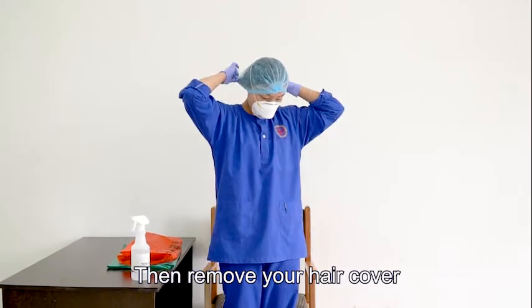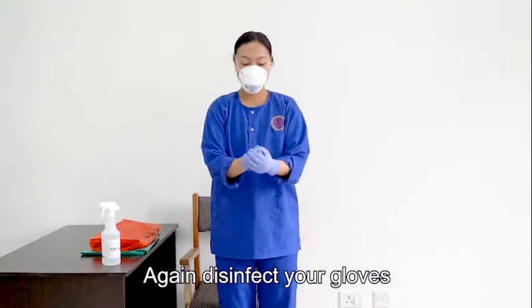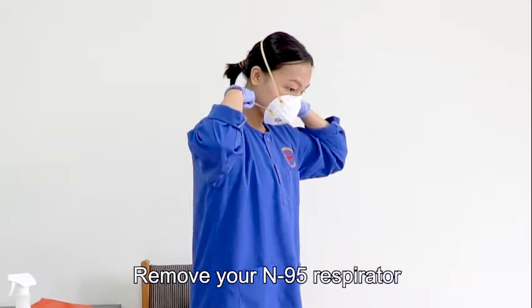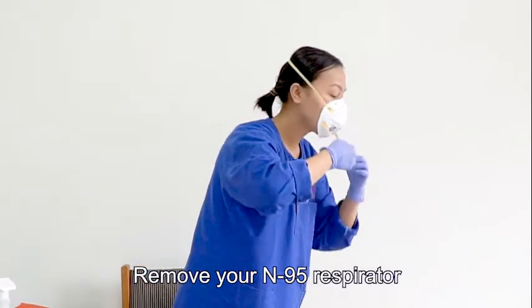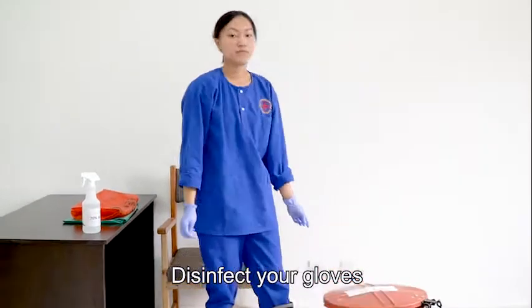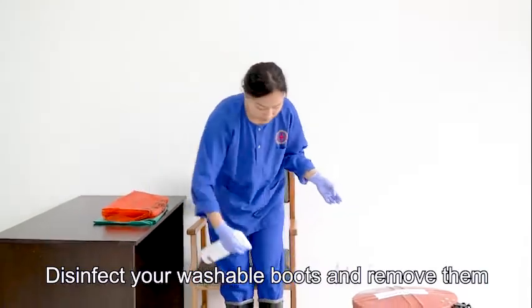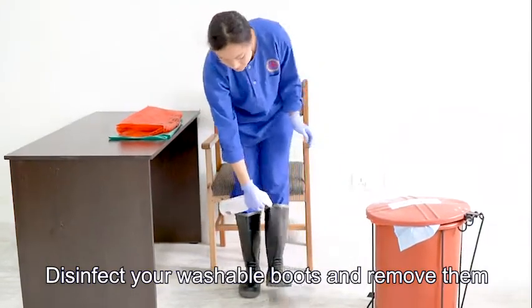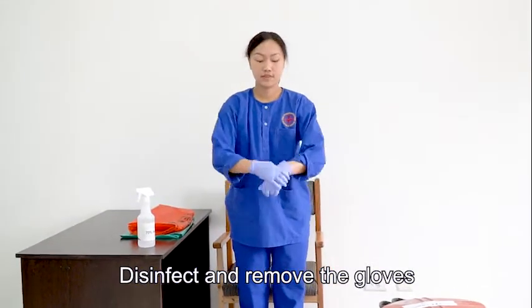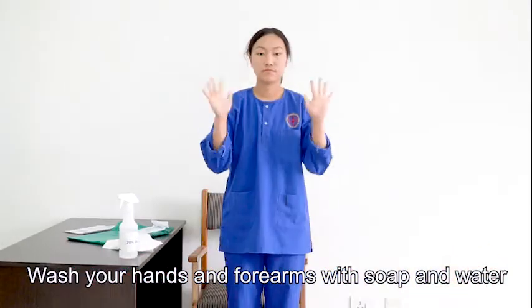Then remove your hair cover. Again, disinfect your gloves. Remove your N95 respirator. Place the respirator in the Biohazard bag. Disinfect your gloves. Disinfect your washable boots and remove them. Disinfect and remove the gloves. Wash your hands and forearms with soap and water.